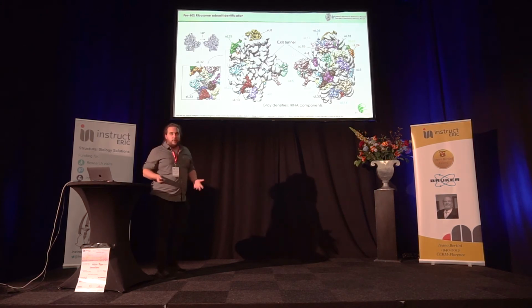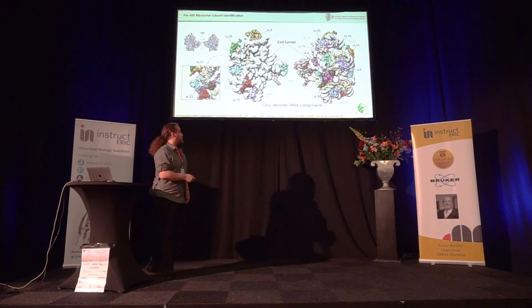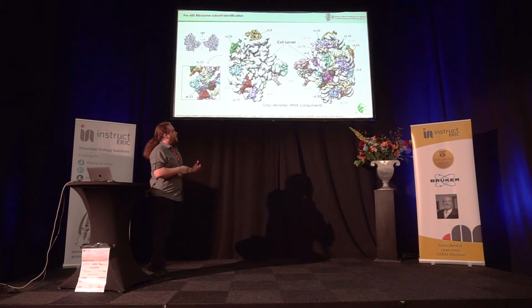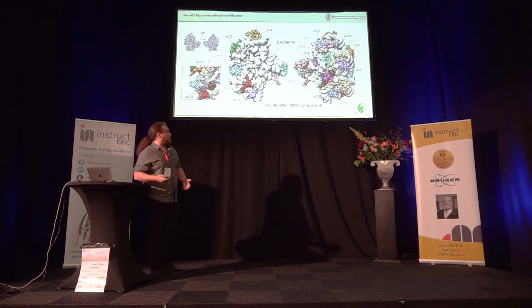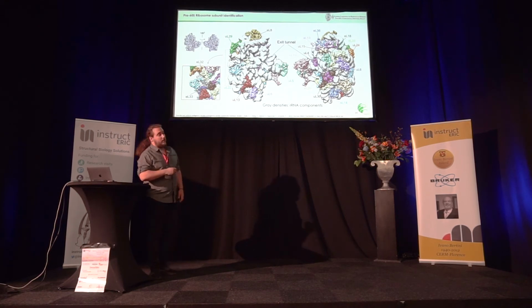After we have our reconstructions, we can investigate further to acquire high-resolution structural insights. In the case of the 60S, we could fit various already published pre-60S ribosomal subunit components and identify 23 ribosomal subunits that take part in ribosomal biogenesis. We could also see that one of the higher-order structural features formed during ribosomal biogenesis is the protein exit tunnel.